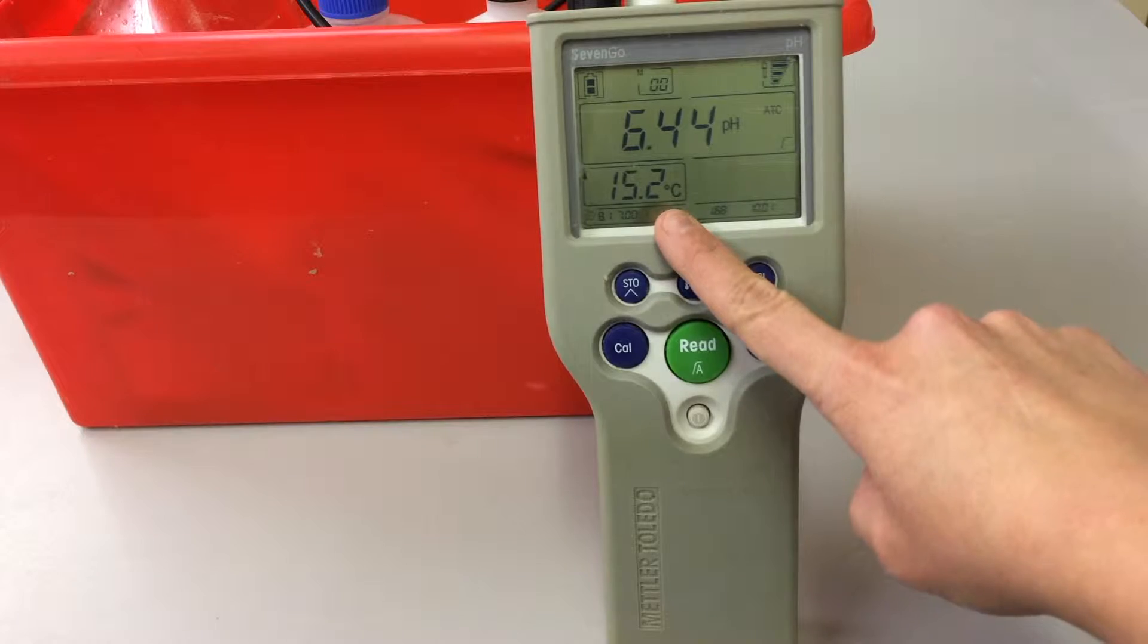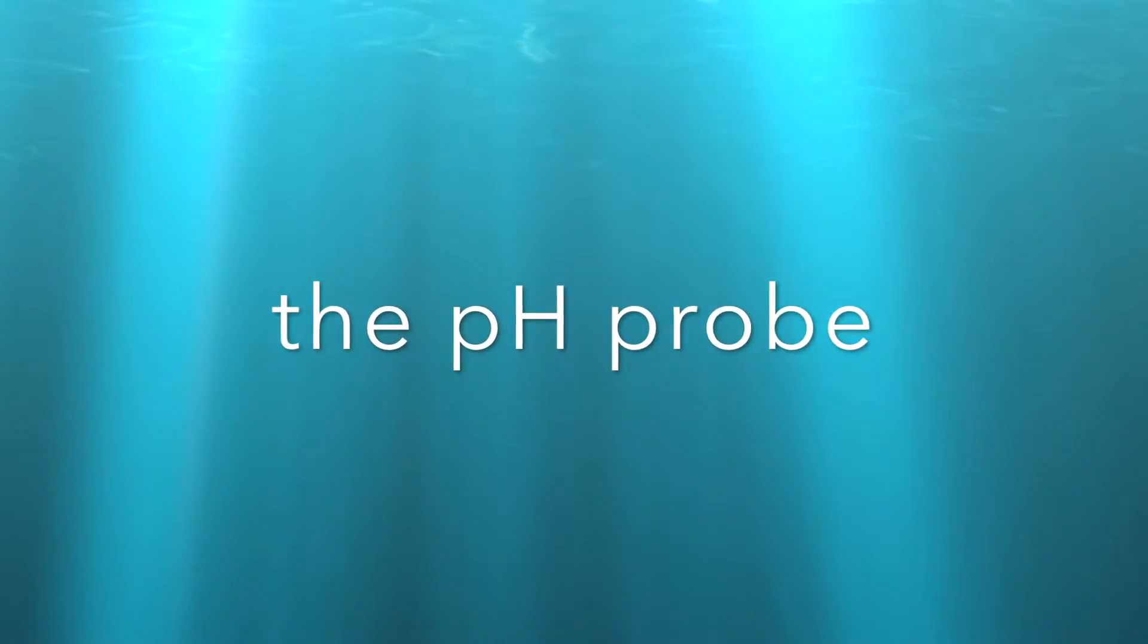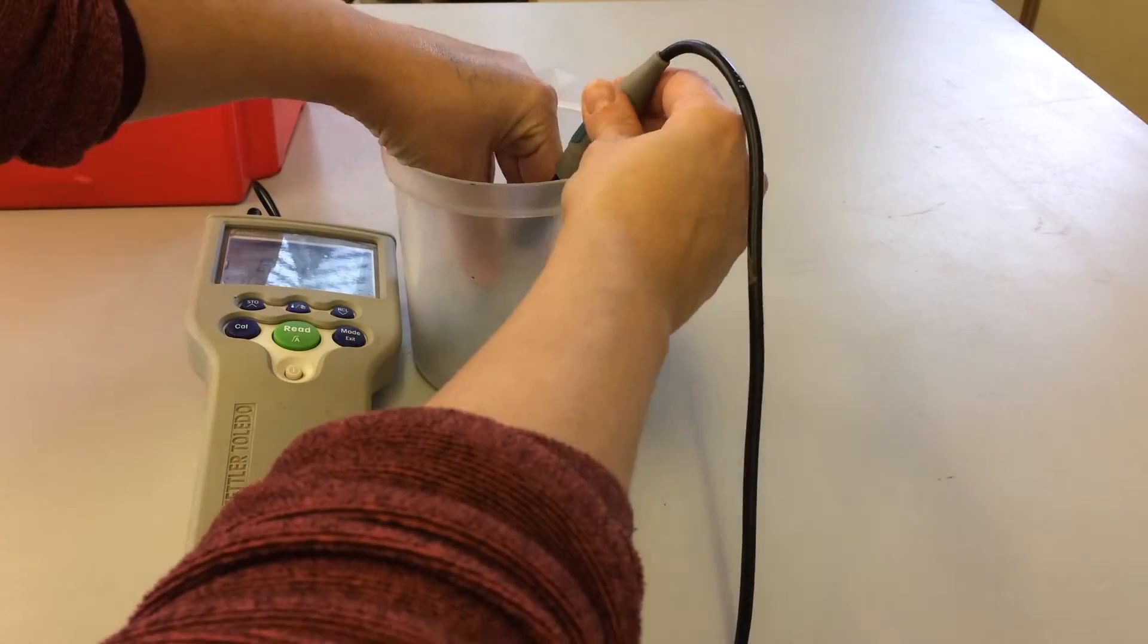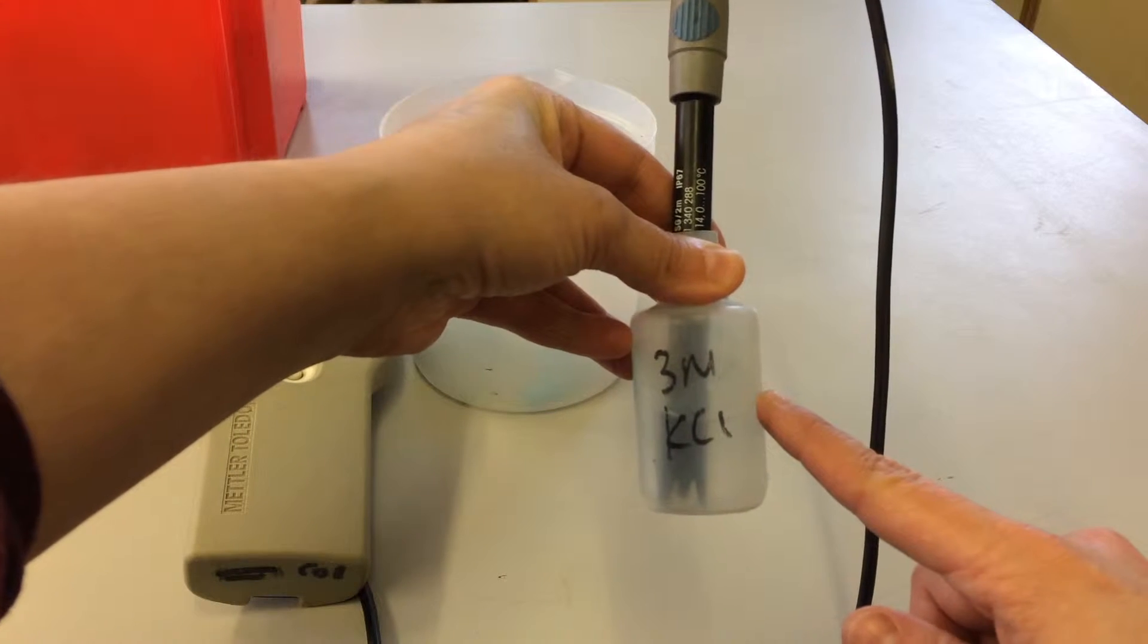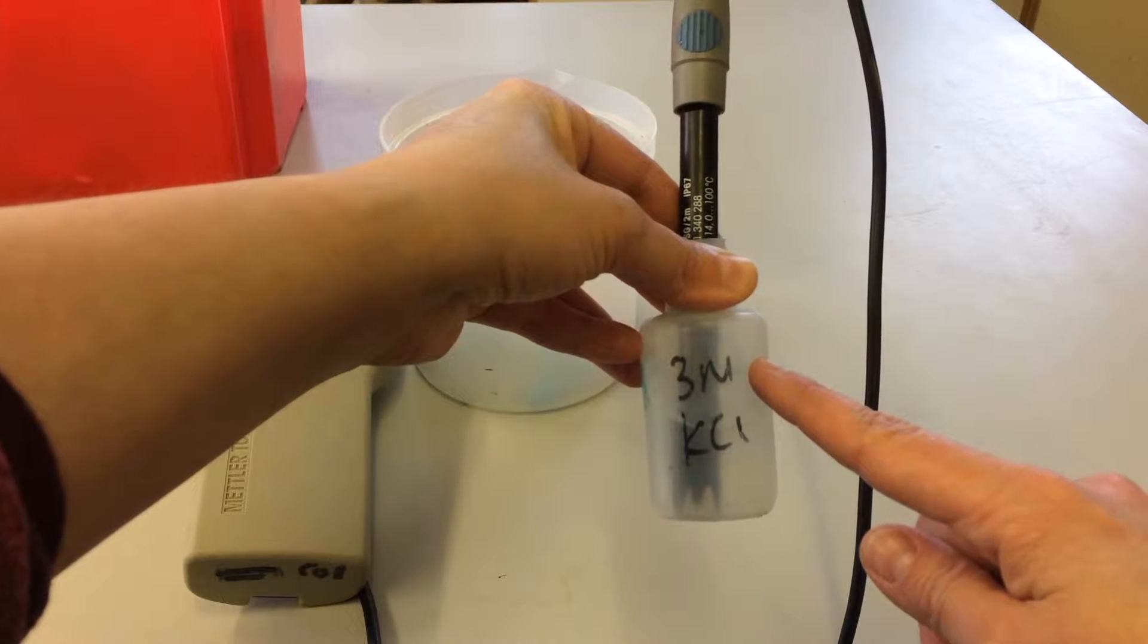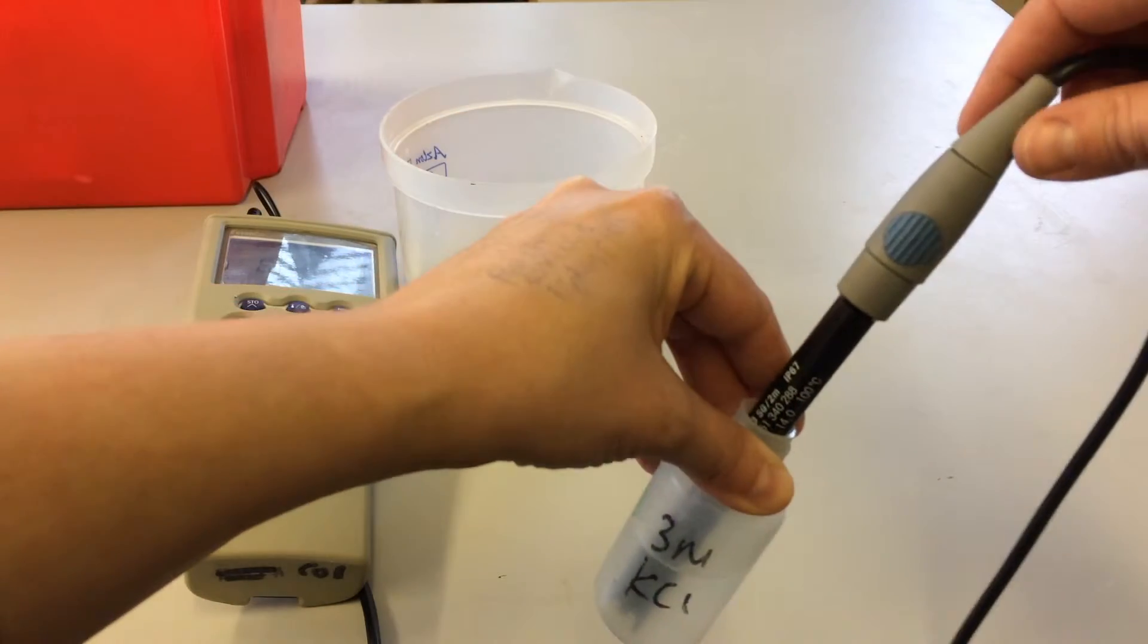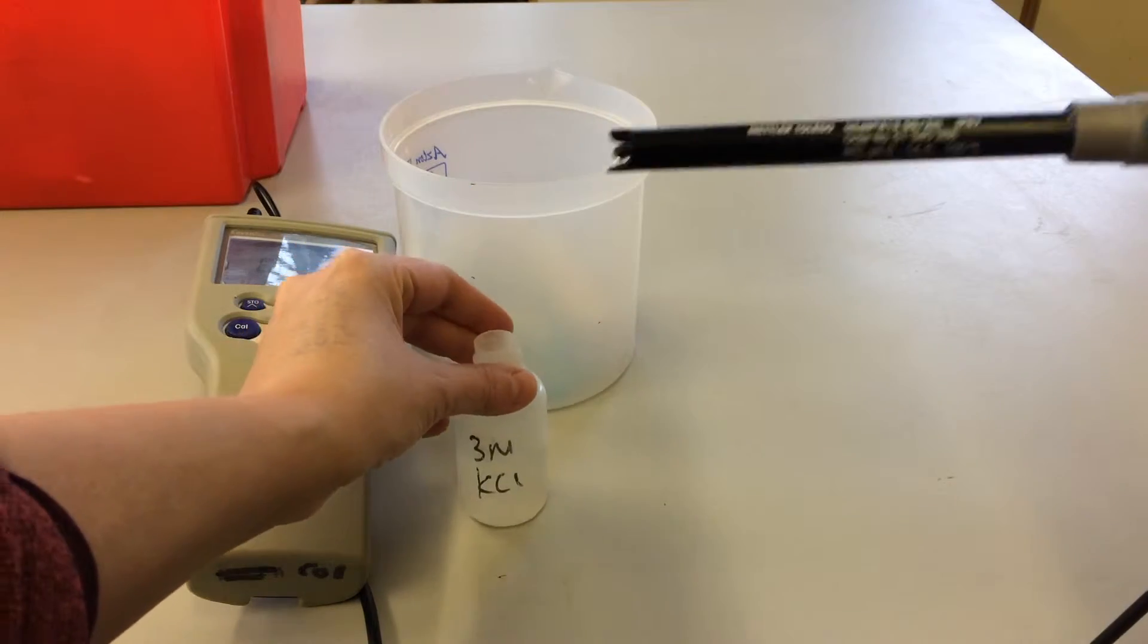Here we have the pH reading and then here we have a temperature to one decimal place. You'll notice that we keep our probe in a harsh salt, three molar potassium chloride. So take care of this. This does have an associated COSHH form, so make sure you're wearing gloves and goggles when you're handling this and make sure you rinse the probe after you've used it.